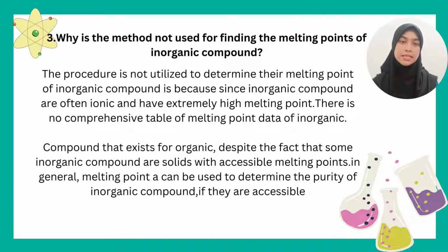There is no comprehensive table of melting point data of inorganic compounds that exists as it does for organic ones, despite the fact that some inorganic compounds are solids with accessible melting points. In general, melting point can be used to determine the purity of inorganic compounds if they are accessible.